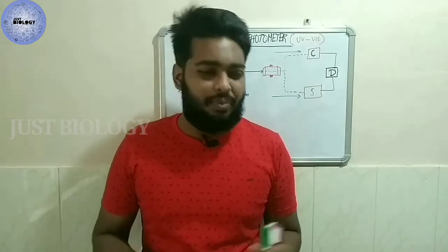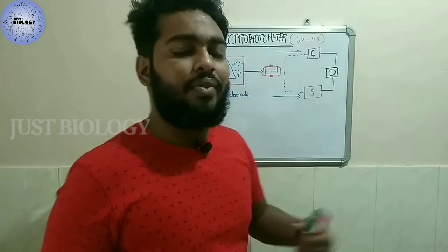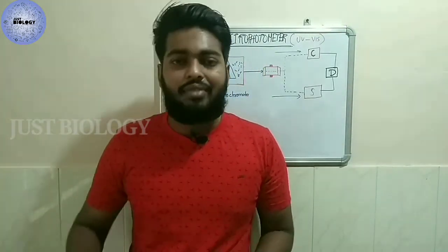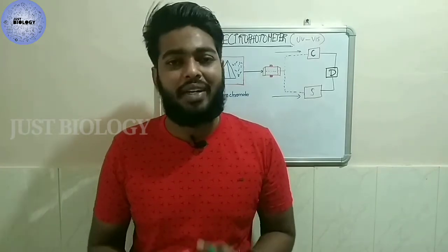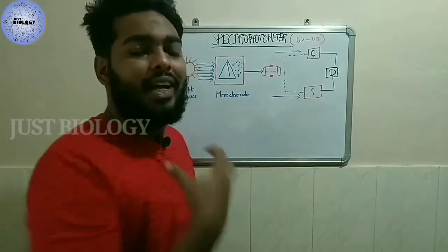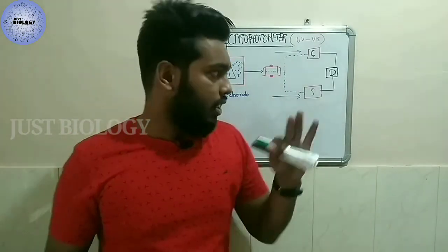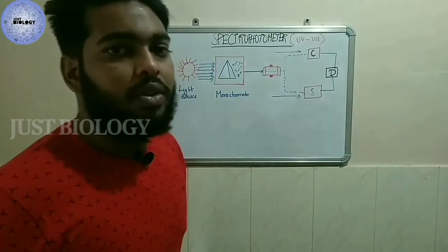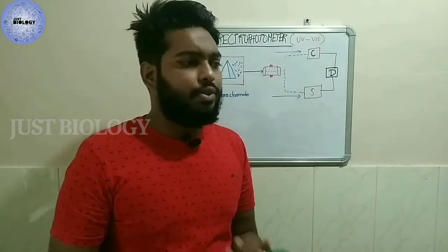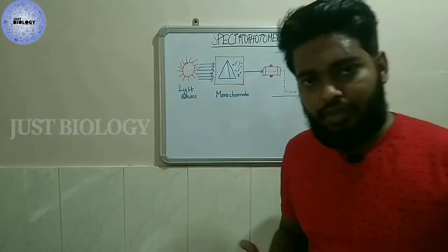That is the major disadvantage, I would say, because we have to take the reading, calculate it manually, and then plot the graph and all. This is actually a big task for us. But more or less this is quite fine. This is a convenient method for finding the concentration of the unknown molecule. If you want to know the concentration, we can go for the spectrophotometer.